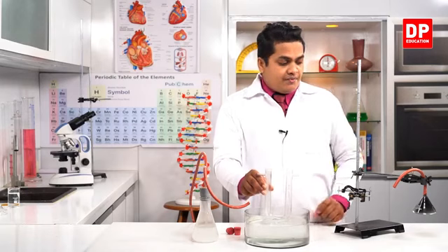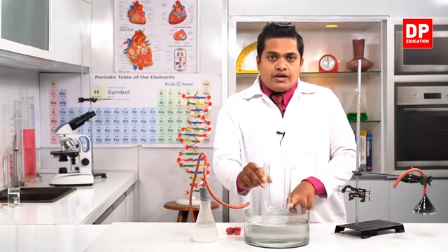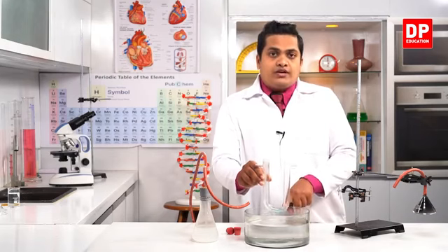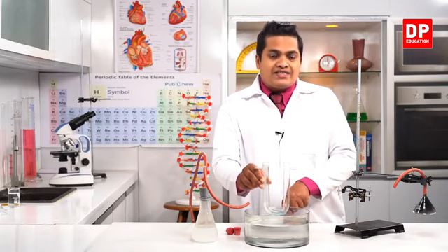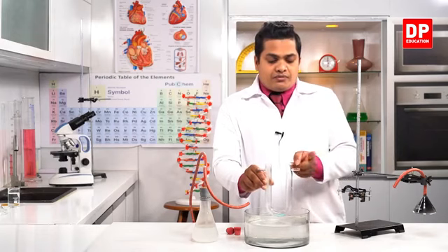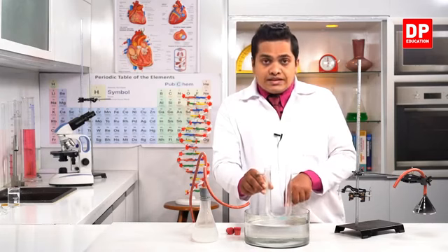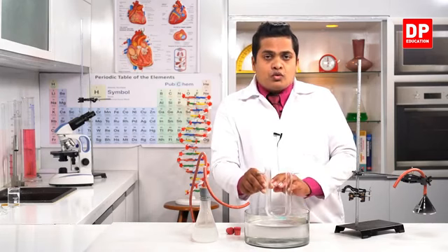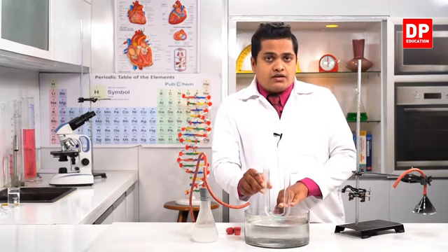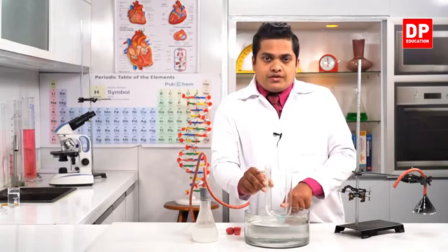It's because the vapor which is coming out from the system is getting cooled down due to the water which is contained in the trough, right? It's getting condensed. Water vapor which is coming out from the delivery tube is getting condensed due to the lower temperature within the water trough. So to cool the vapor or the products which are coming out from the candle, we can use this water trough, right?